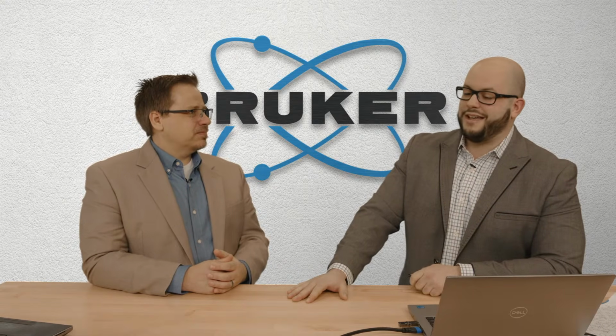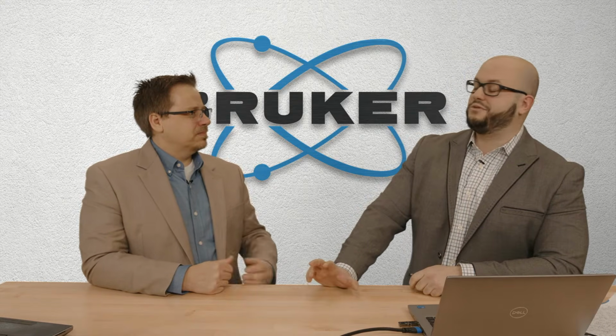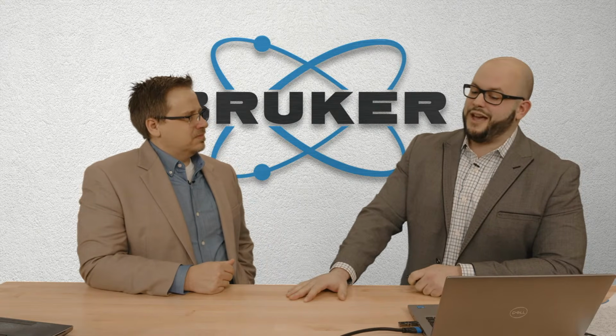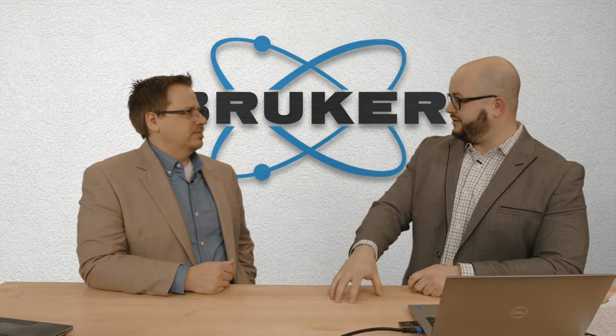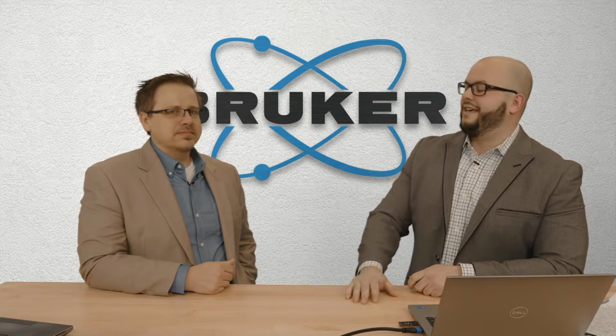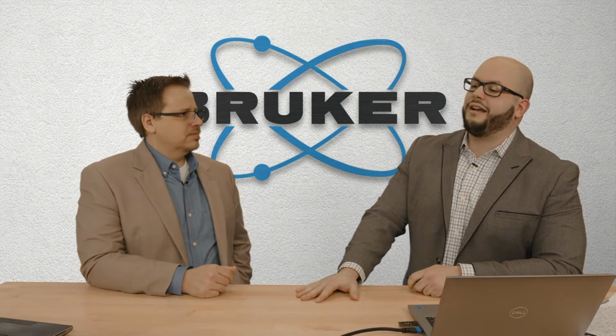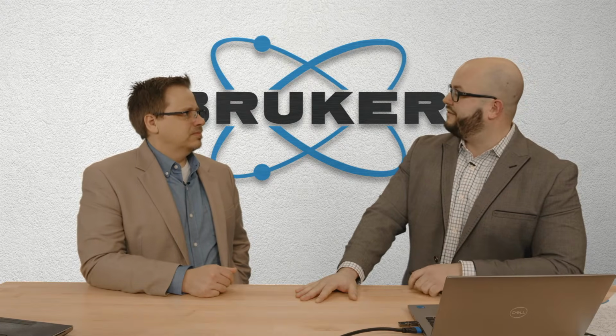But like you said up there, with residual stress what we're really measuring is strain and then converting that into a stress. This has been one of those pervasive things where it's really important to get a good characterization of the stress in all these different engineering materials that you see out there, to prevent catastrophic failure and things like that.